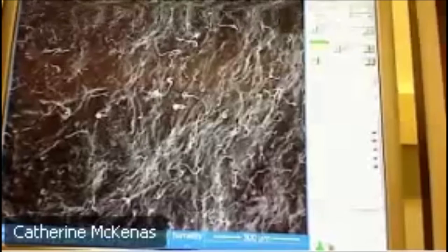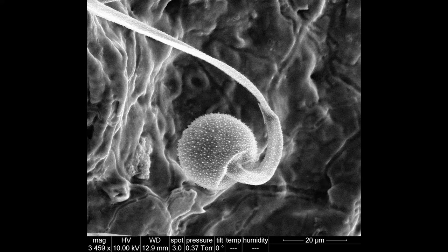So let's see. We're going to take a picture for y'all of one of the zoomed in seeds. Are y'all able to see kind of how they're all spread over the poop? Yeah, this is a good one. Look at that. That one's cool. Really nice. A really cool one. Is that like a sprout coming out of it? Yeah, it's already started to germinate in the poop.